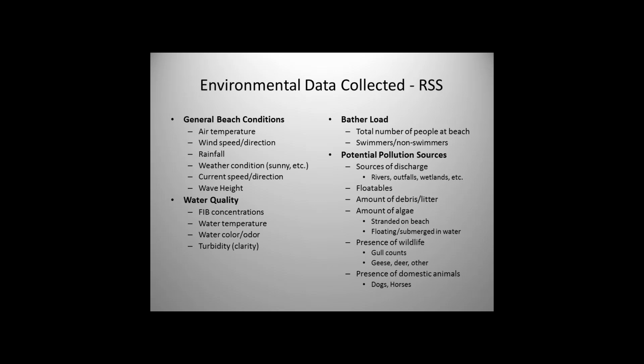The water quality characteristics, so again, just collecting your water samples. For several of our beaches, when we were doing our initial assessments, what we consider collecting baseline data, we did multiple samples at our beach where we did spatial sampling. So we collected up to 9 or more samples at the beach at different transects and at different depths. We did that to understand the concentrations of E. coli in the near shore moving out. And if we had impacts such as stormwater outflows at the north or south ends of the beach, those samples would give us an indication if the water quality was being affected by those potential sources.